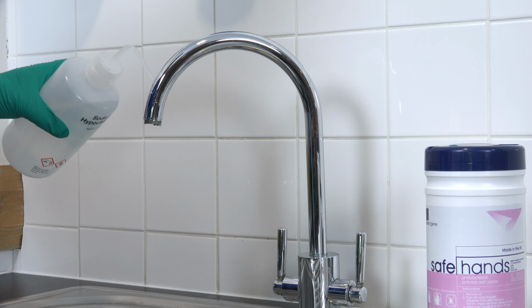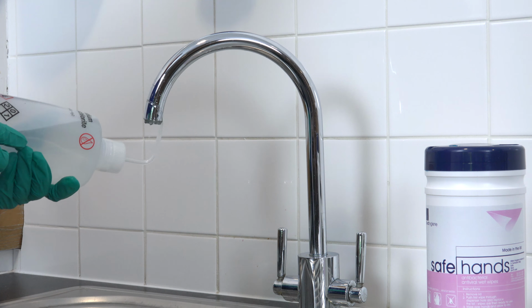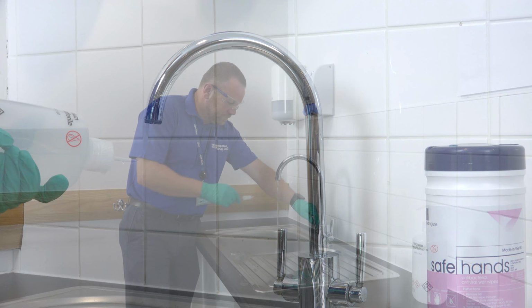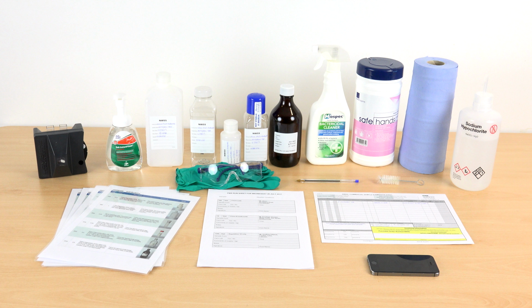Before taking any microbiological samples, it's important to thoroughly disinfect the sampling tap. This effectively minimises the risk that any bacteria residing in the tap will contaminate the sample. To disinfect a tap, you'll need the following items: a clean, stiff bristle brush, a 1% sodium hypochlorite solution, safety glasses, latex gloves, microbicidal wipes, kitchen roll, a Ziploc bag and a timer such as the one on your mobile phone.